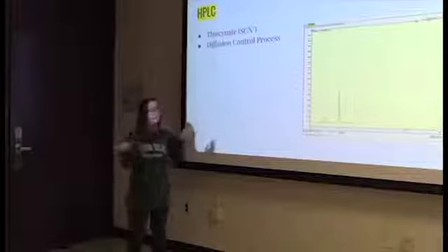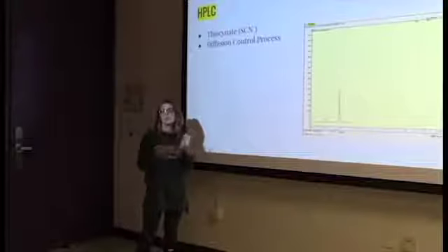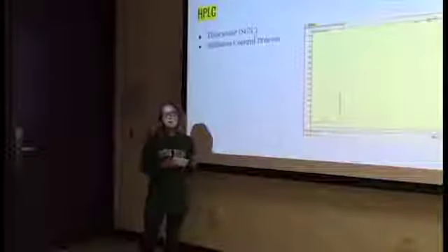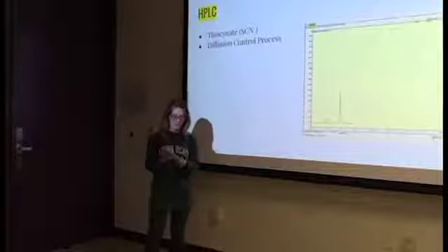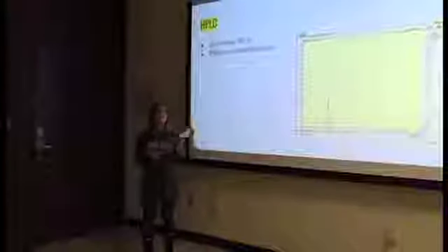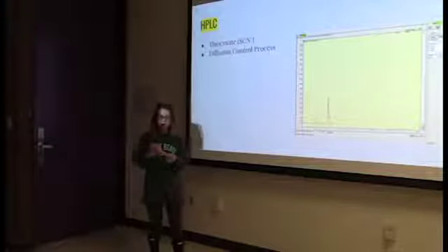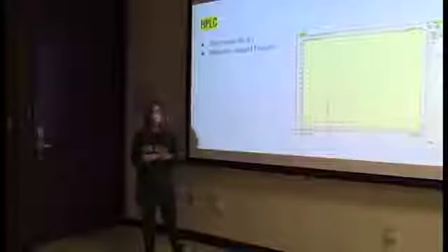So what that information means is that as you increase the concentration of the ligand, which is the thiocyanate or the curcumin, you're pushing your equilibrium forward, or to the right, which is exciting. The complex is coming together. And what that told us is that the complex formation is a diffusion-controlled process. That just means that the ligand concentration is the most important factor when pushing the equilibrium to the right in an organic solvent.